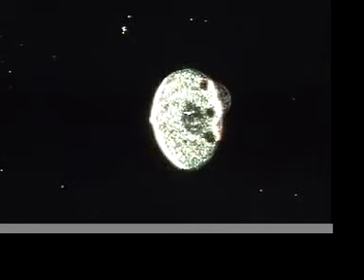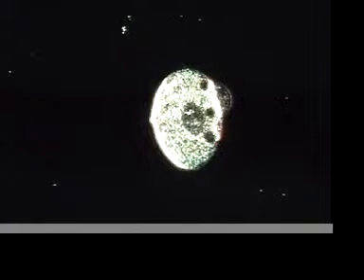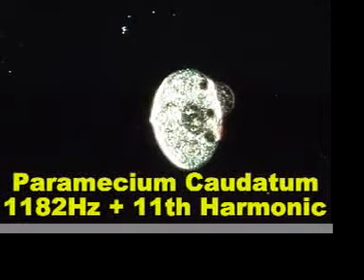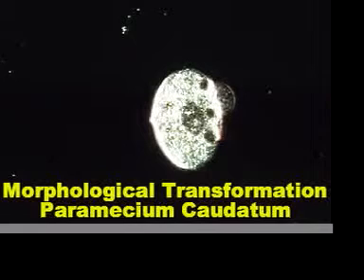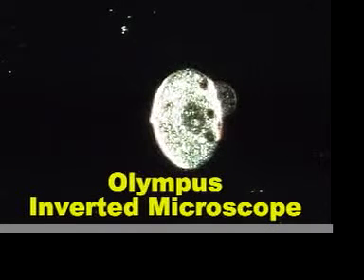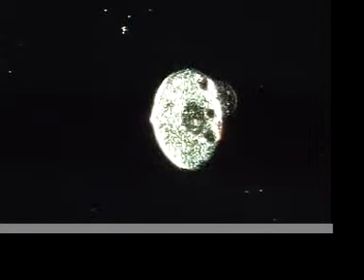Here we're seeing a blister forming in the upper right of this organism, so it's undergoing a change, actively changing in real-time, looking at it from below through an inverted microscope. Current frequency is being held at 1182 Hertz plus the 11th harmonic. Now you can see the blister growing up the right top and you can see also a kind of a glittering effect that goes on. I believe that this glittering type effect is a clue to what's causing these morphological transformations.